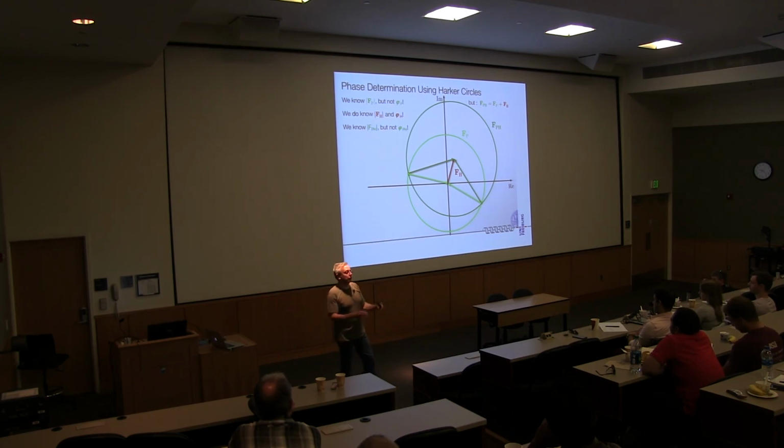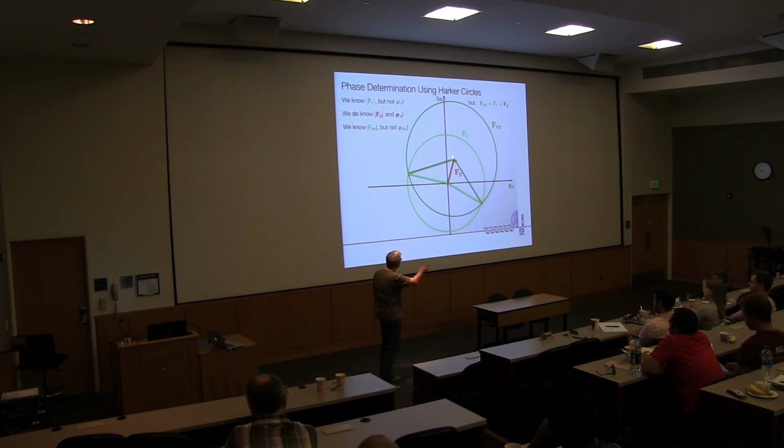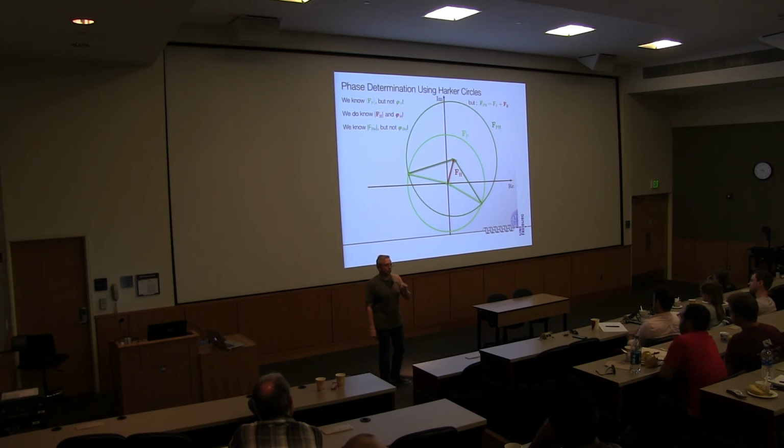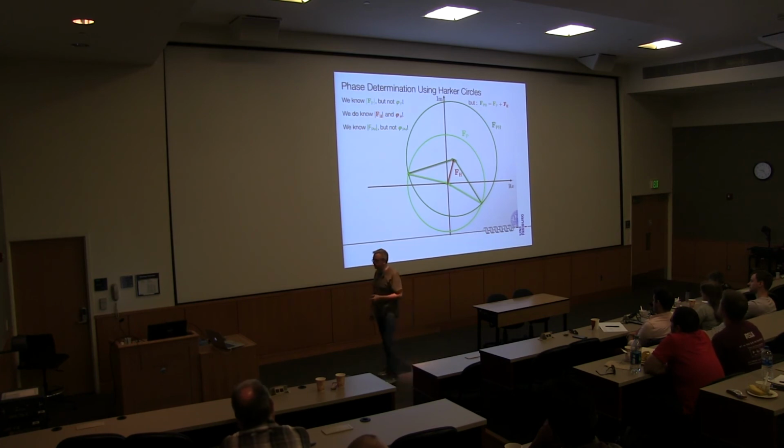And to get over that, we need some additional phase information, which I'm not going to go into detail, but that's the basic idea. That is why only knowing this little arrow of metal sites that don't even have to be part of your metalloprotein, you can make a thallium or mercury or whatever soak of your structure and determine these atom positions. And if you have those, they actually help you to get this phase triangle completely, and then you have the phase angle and the structure. And that is basically the end of structure solution at that point.